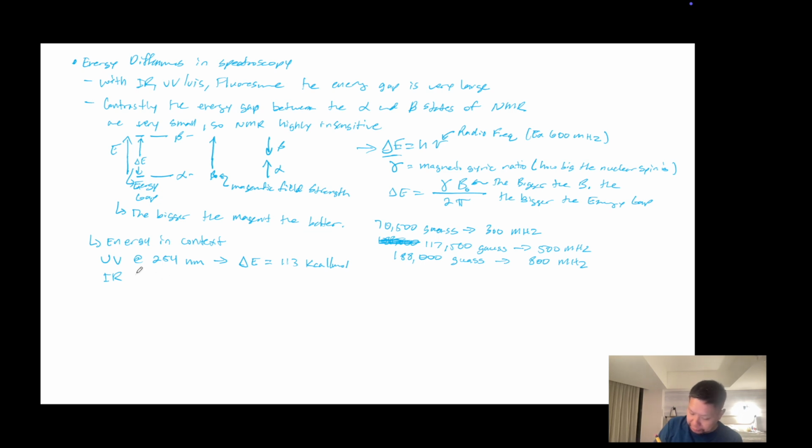And we'll just use a very common stretch here, which is a carbonyl stretch. That's at 1700 wave numbers, or reciprocal centimeters, right? If we do the calculation and convert it to change in energy in kilocalories, this actually corresponds to 4.87 kilocalories per mole.